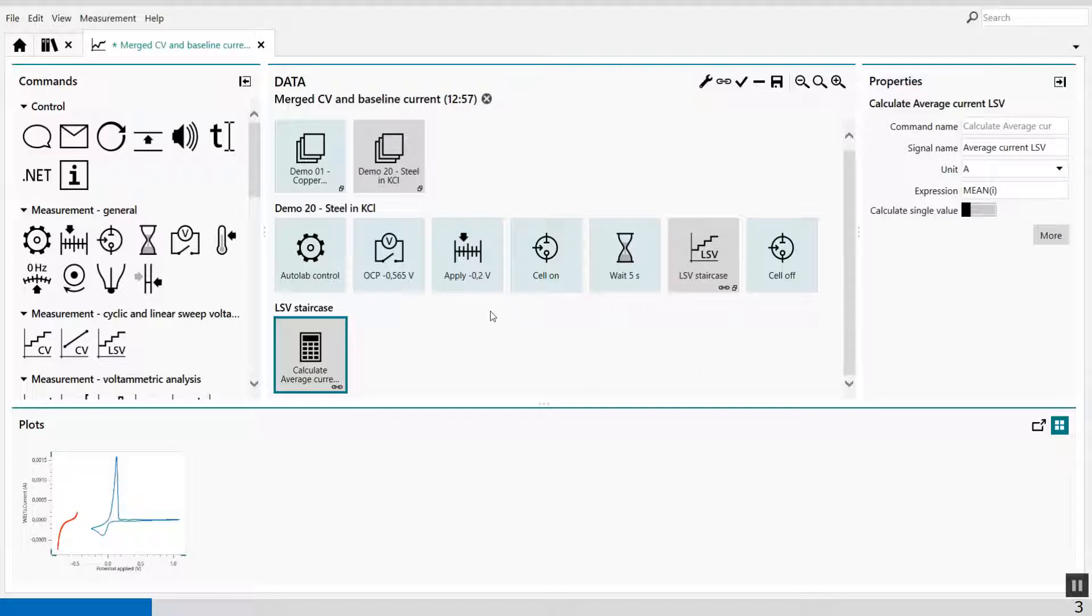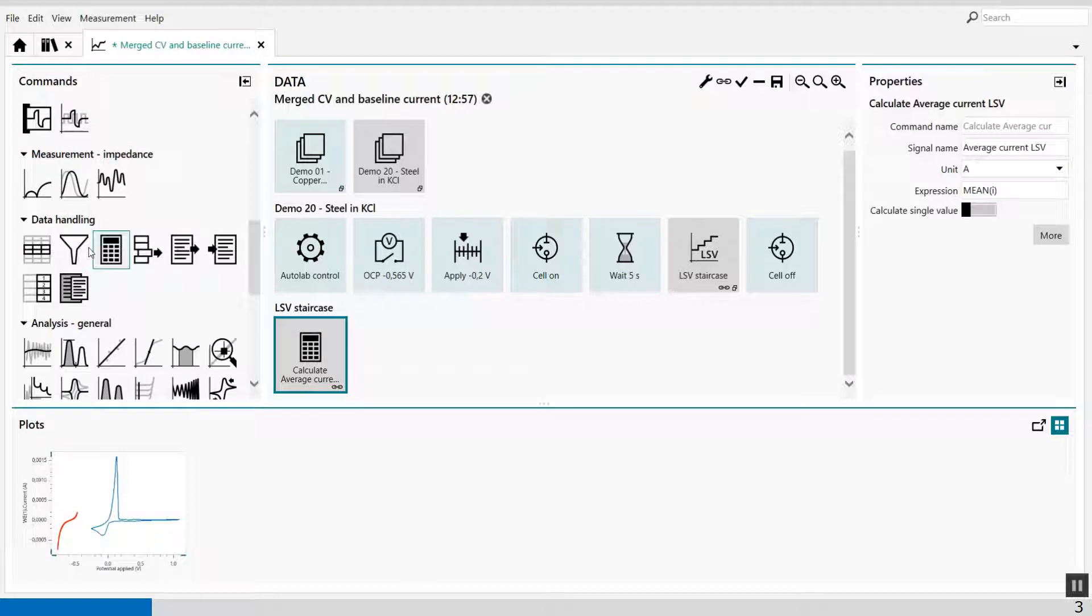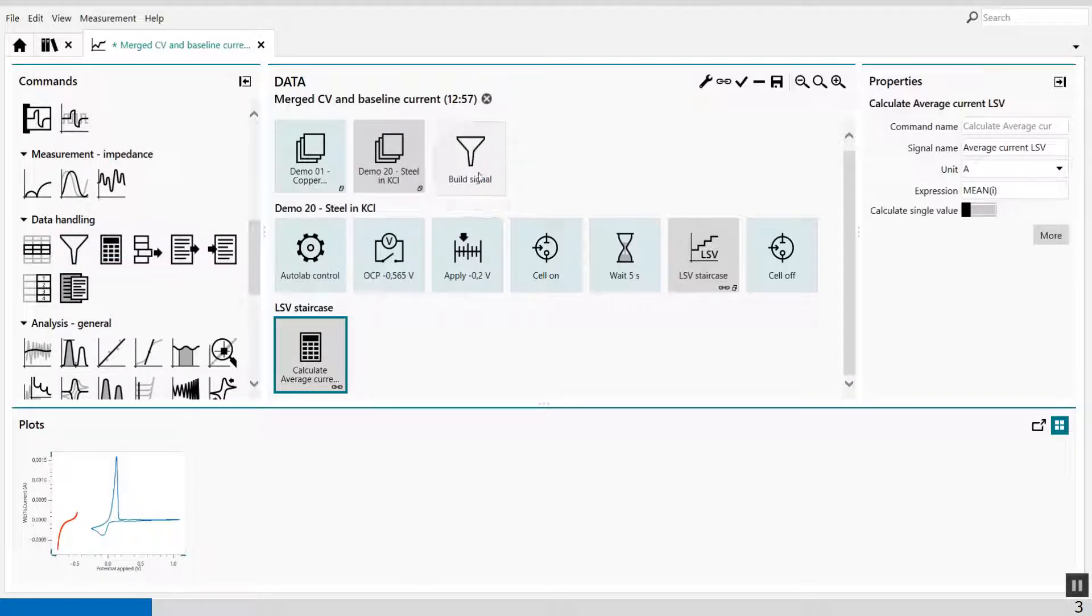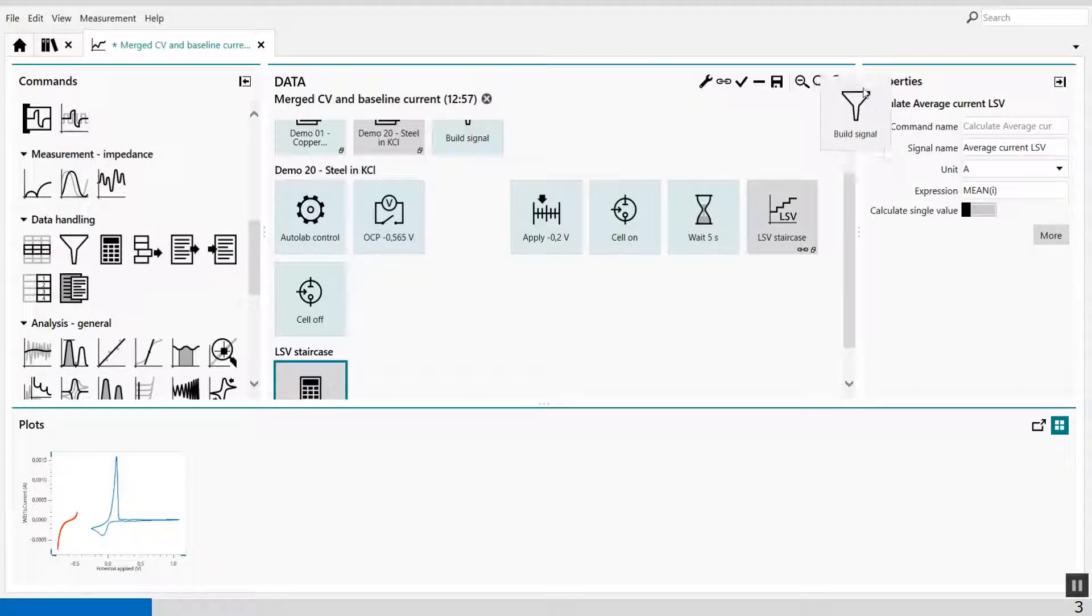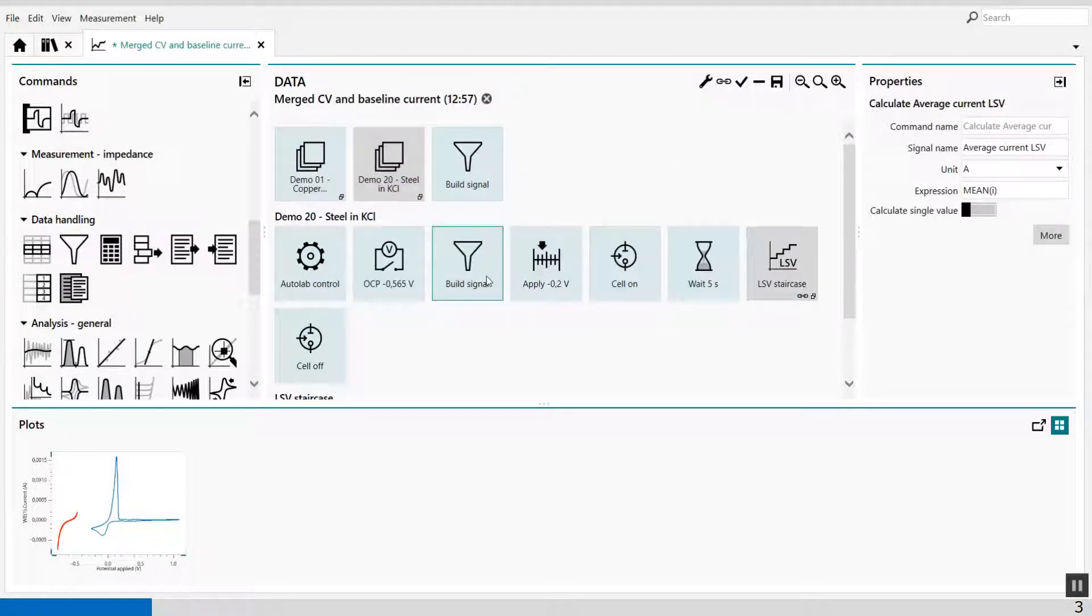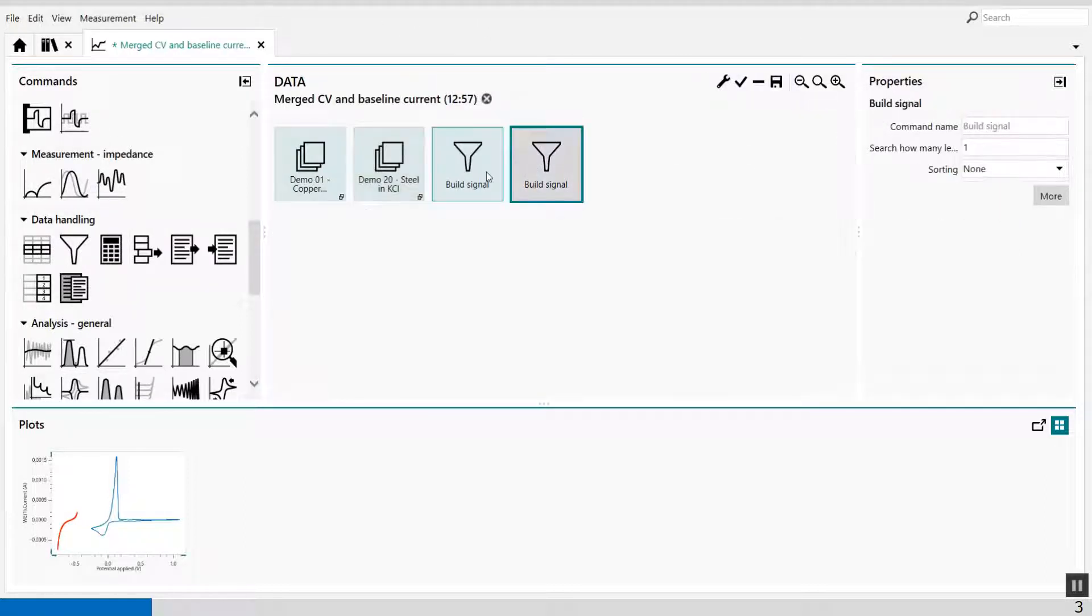The next thing I have to do, I have to extract information from the CV, but also I have to extract information from the LSV. And that's done with the build signal command. In the build signal command, I have to drag it twice into the top file.